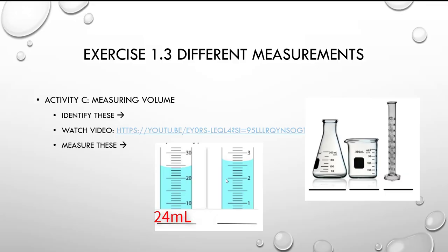This would be between 2 and 3, so you can figure out what that one is. I won't tell you the answer, but this one's definitely 24. I think this is milliliters, you have to look in your book. All right.